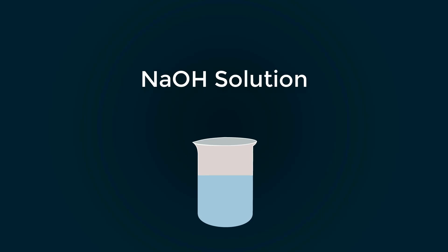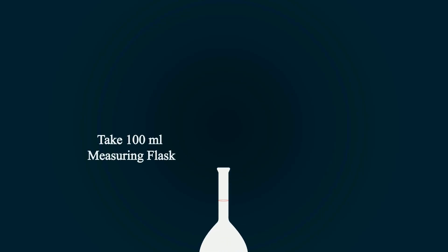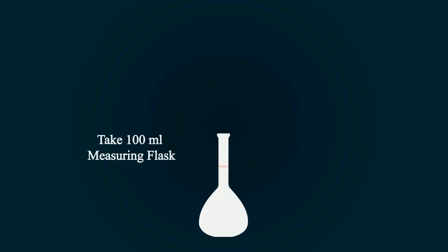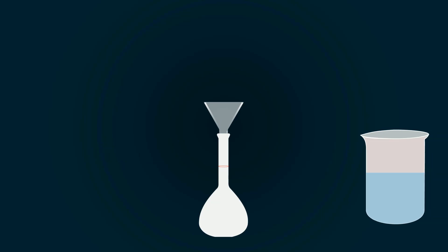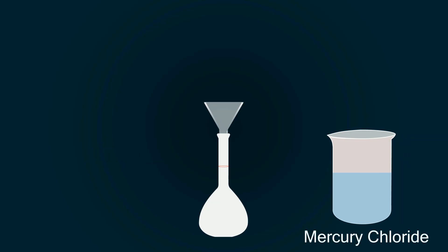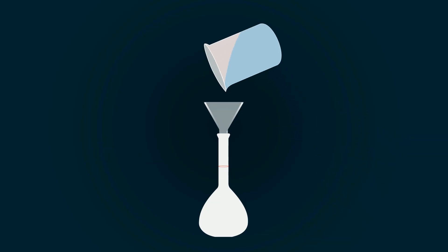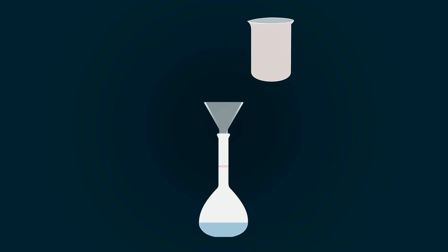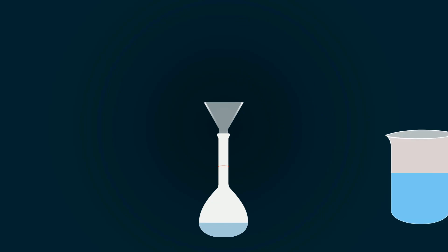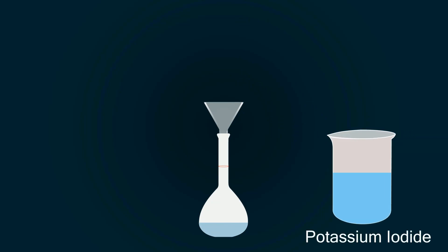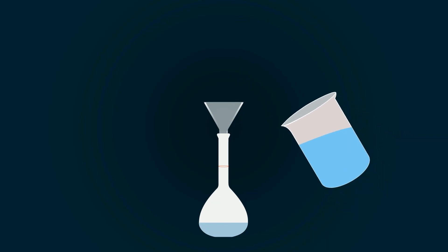Now it's time to mix these solutions. Take a 100 milliliters volumetric flask. Put funnel on the top of flask. Firstly, we put mercury solution into volumetric flask. Secondly, we add potassium iodide solution into volumetric flask.